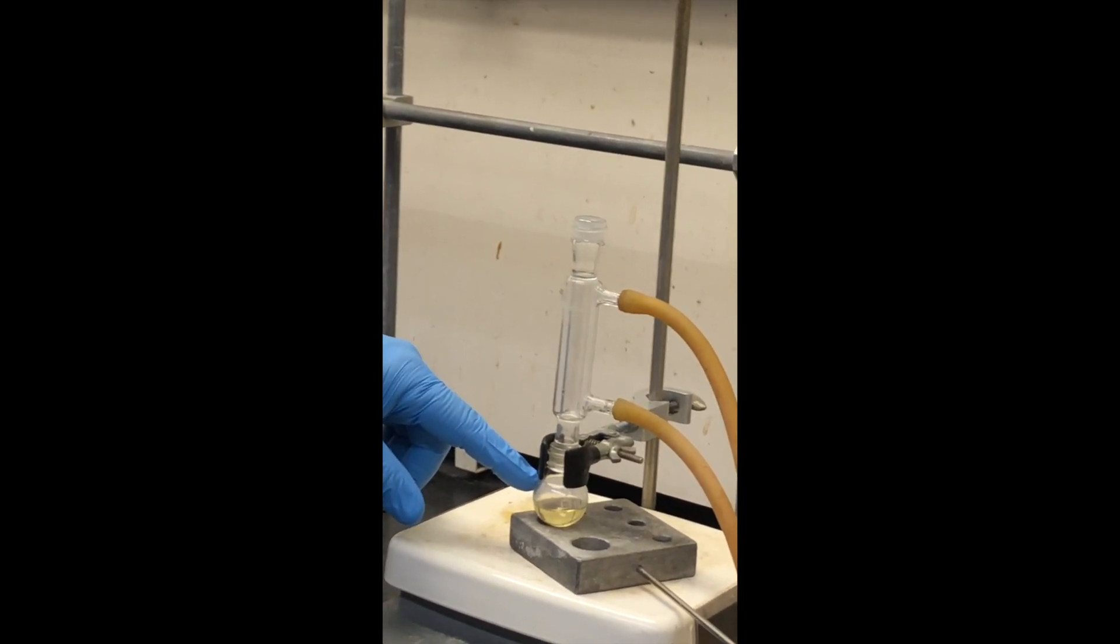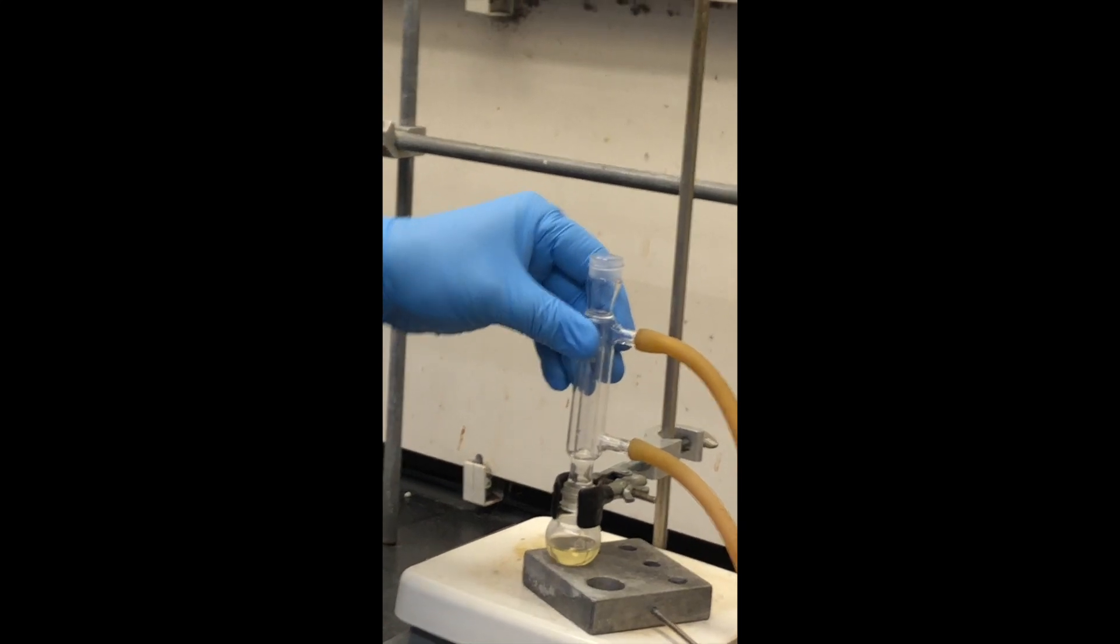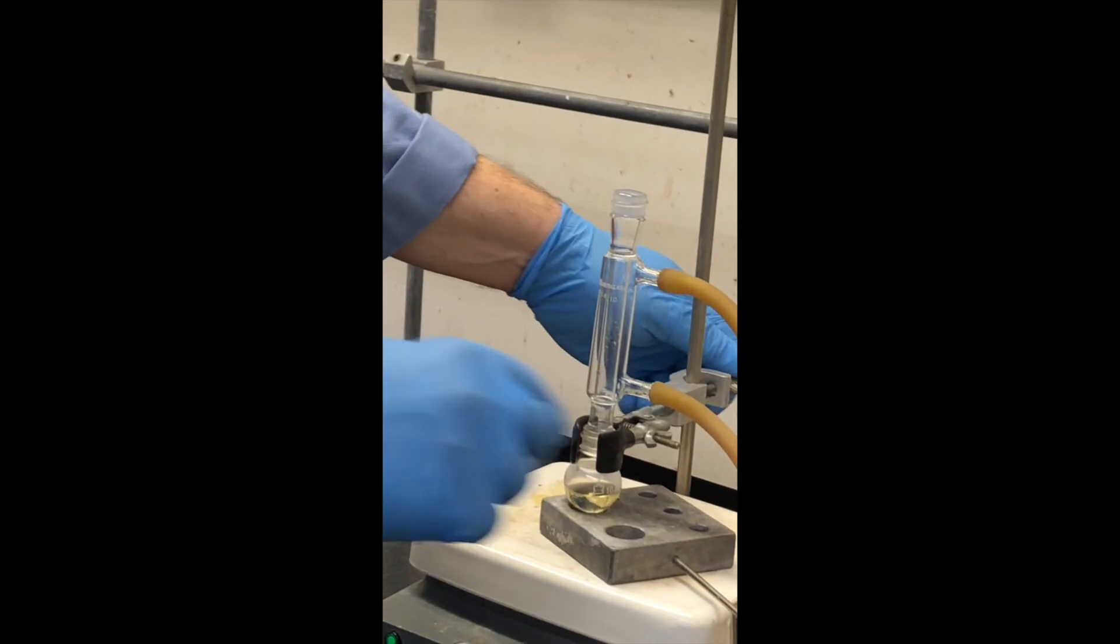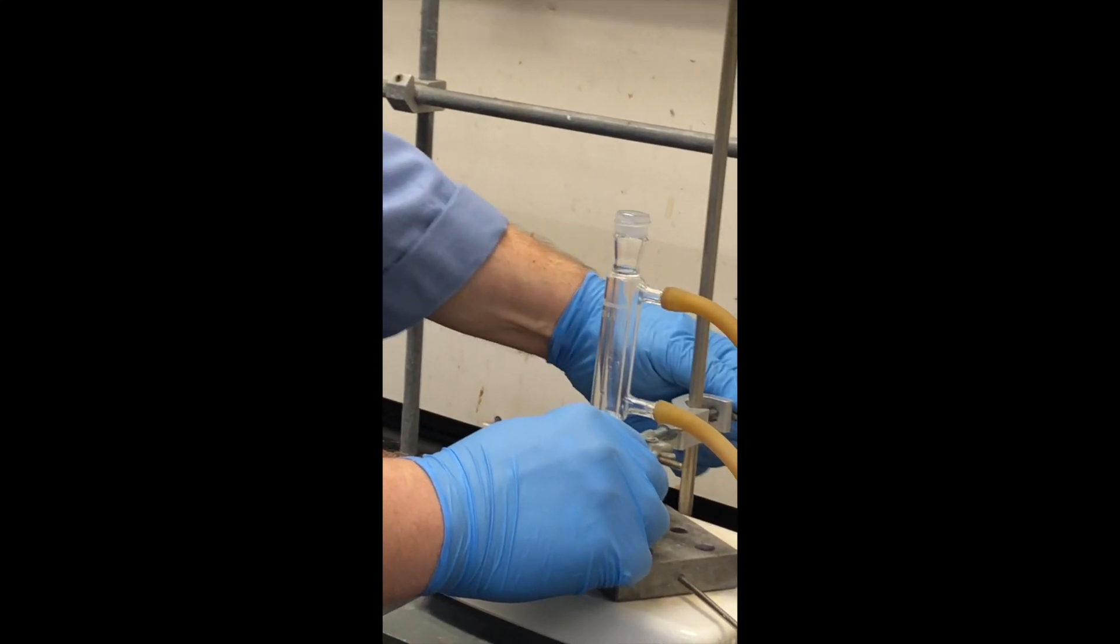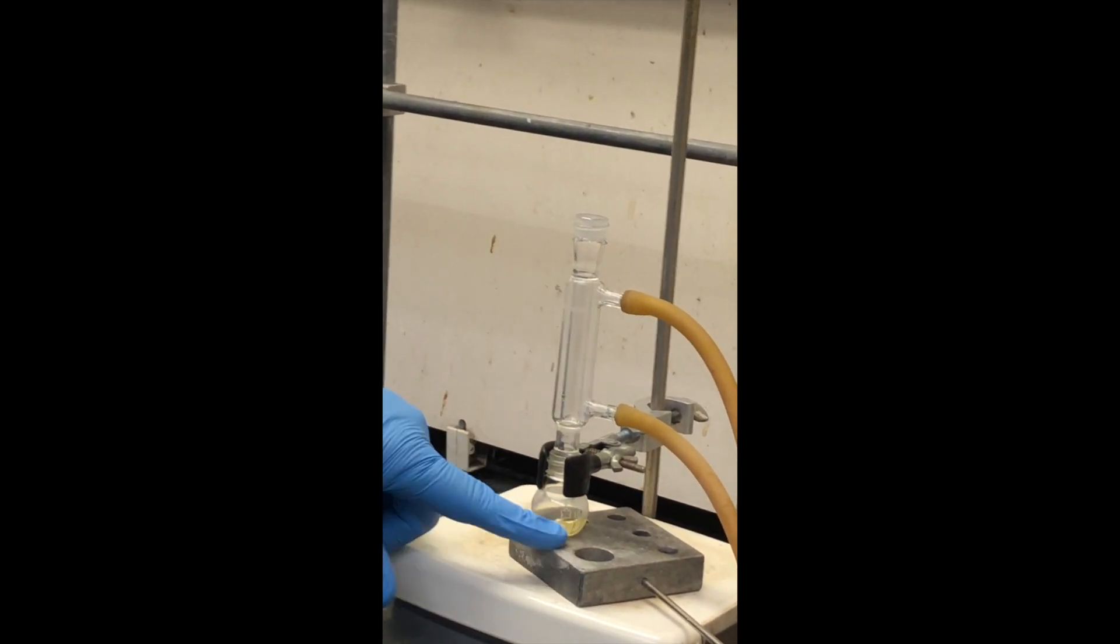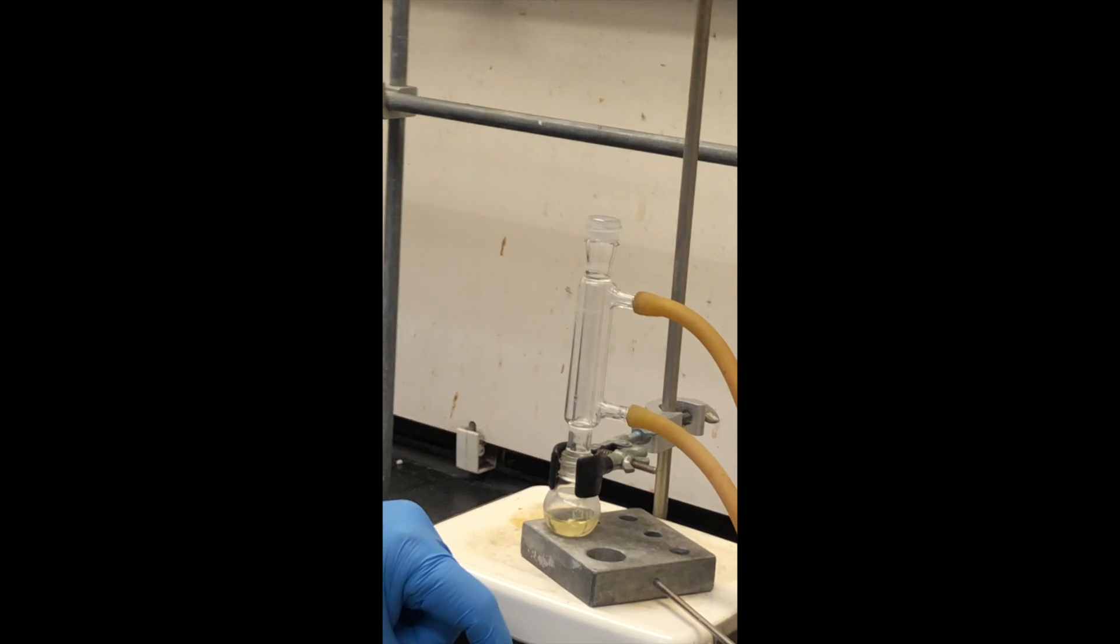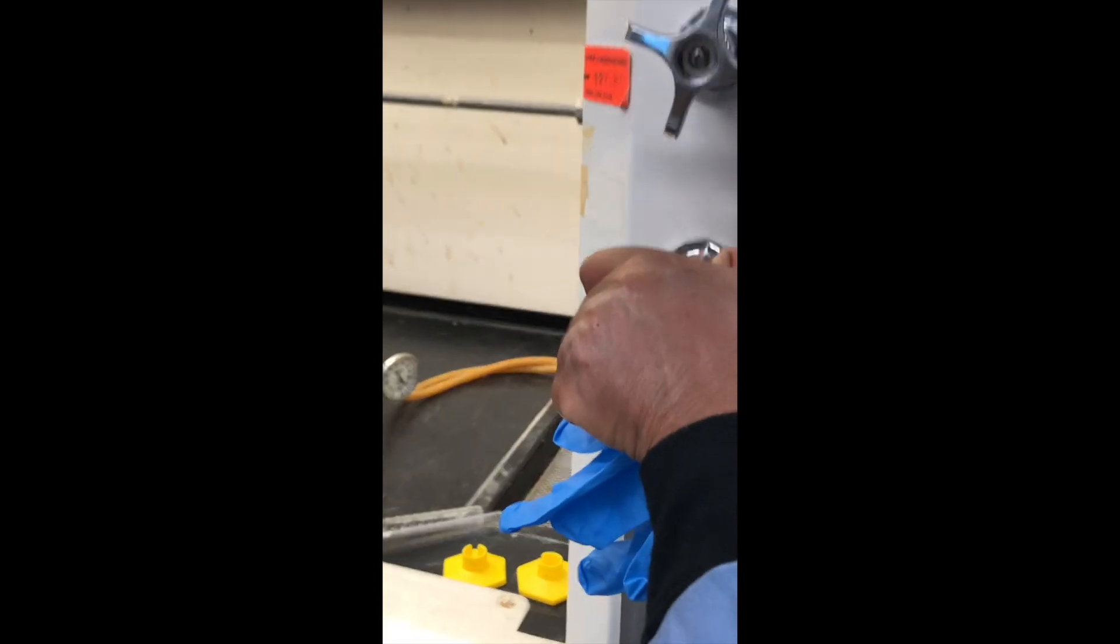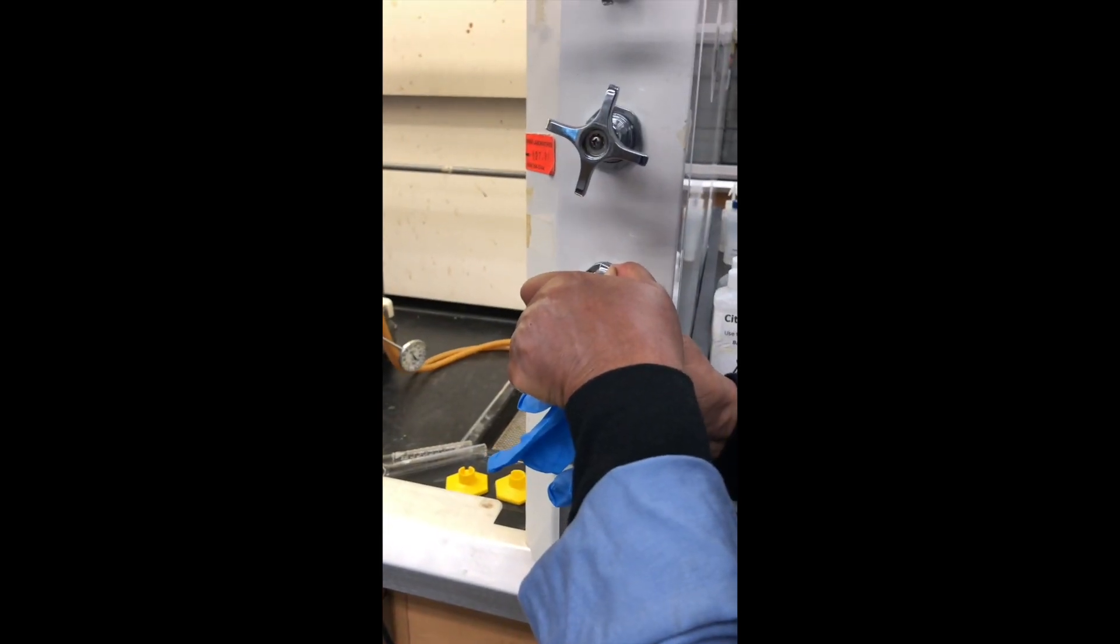We've also added boiling stones and we've clamped the flask securely over the hot plate and we have it snugly up against the aluminum block so that the heat is effectively transferred. The heat has just been turned on and we're going to turn on the water now so that we have our water jacket and condenser going, making sure that the tubes are nice and tight.